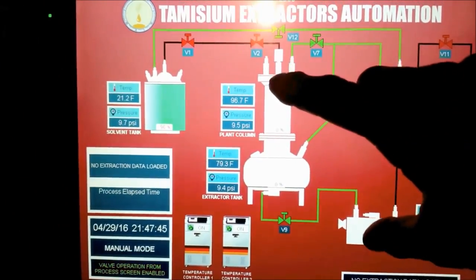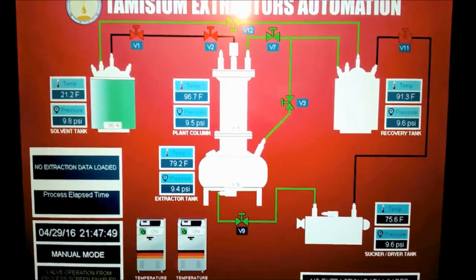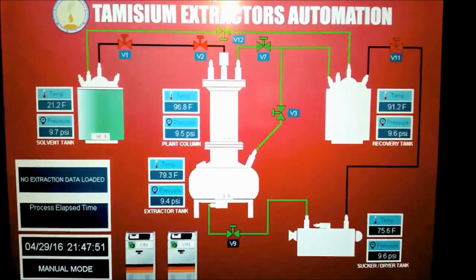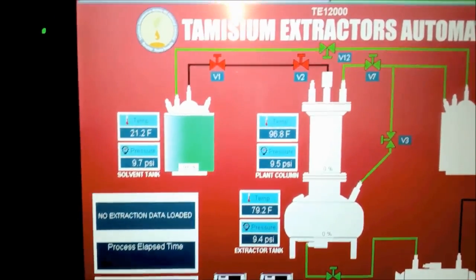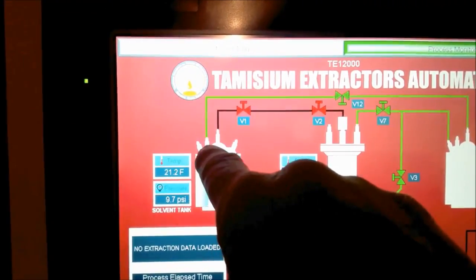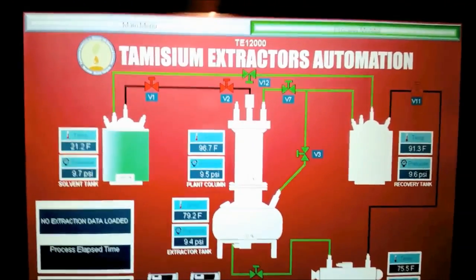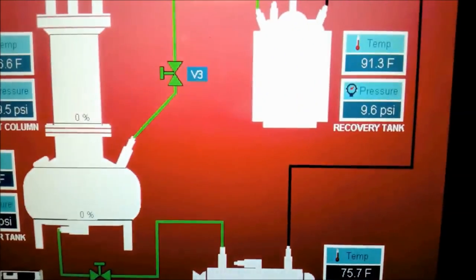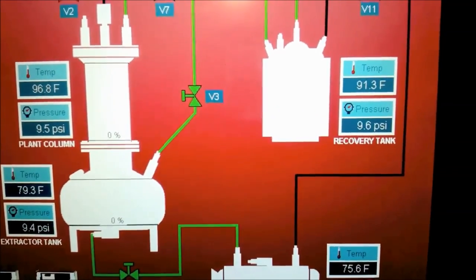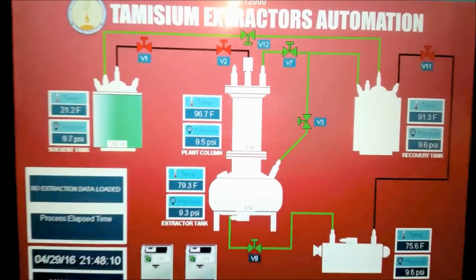Those are the only two tanks that you lose vapor in. But these tanks here you know, we're recovering the vapor from it. So the vapor is traveling back through the green lines back into the vapor input into this tank, through the outlets of all these other three tanks. When those pressures go down to zero or one psi, then we'll consider the process complete. Takes about an hour.